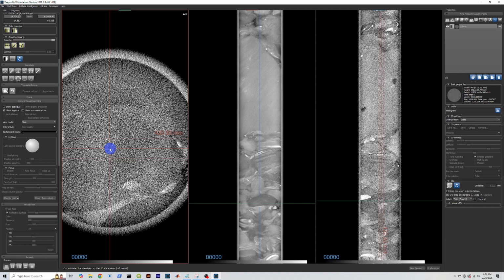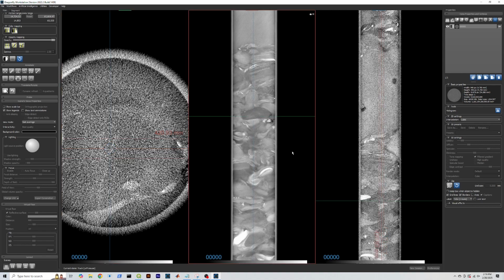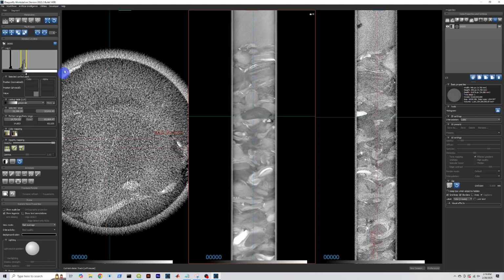Okay, cool. What else can I show you? You can change the color maps here by scrolling up. I think it's back in your window leveling tool. I think you use Inferno a lot, so we'll choose the Dragonfly option. That's sort of like that.